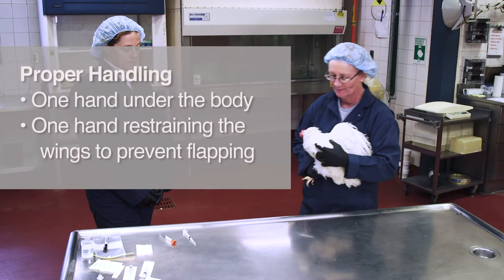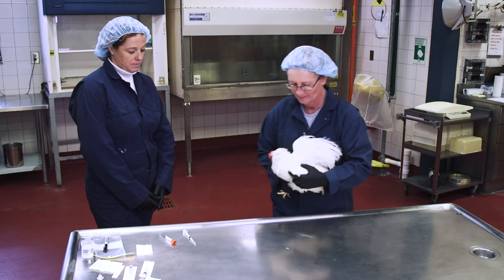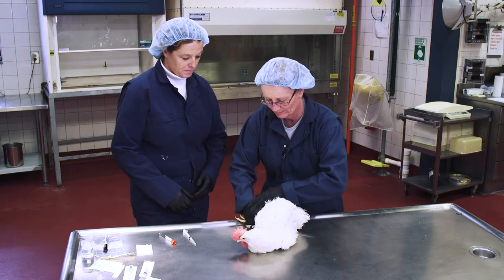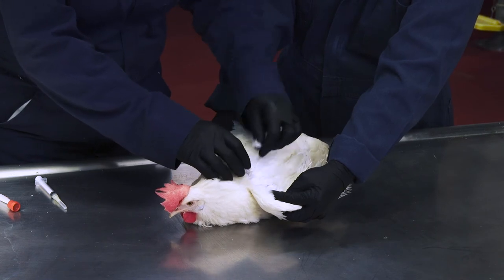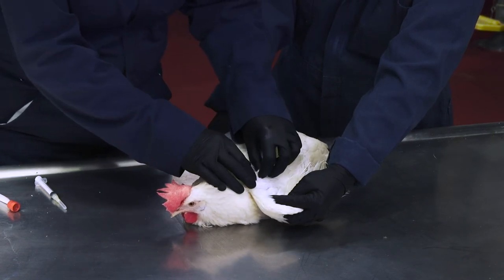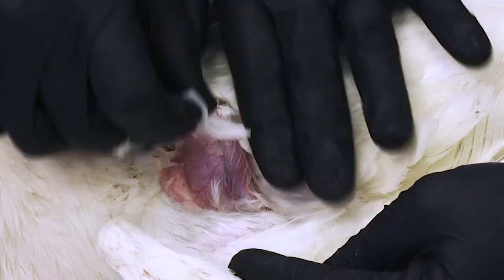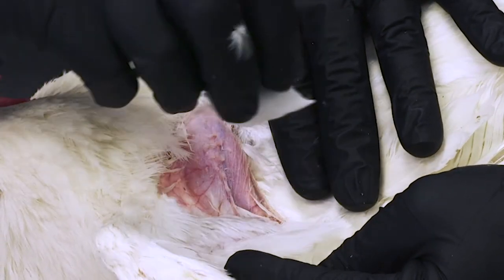One person can concentrate on bird restraint and hematoma prevention, while the other person collects and handles the blood sample. We'll demonstrate the two-person technique with a laying hen. When using a table, one person will pick up the bird using one hand under the body and one hand gently restraining the wings to keep the bird from flapping. Lay the bird on its side, keeping the legs restrained, then gently lift up the wing. You may need to pluck a few feathers to get a clear view of the brachial vein — pluck them at the base gently, quickly and firmly, pulling in the direction of growth. If you need to sanitize the area, you can use an alcohol wipe, which also helps make the vein stand out.